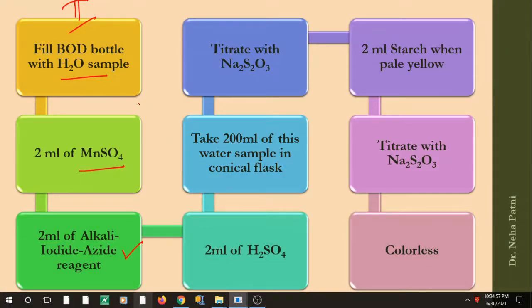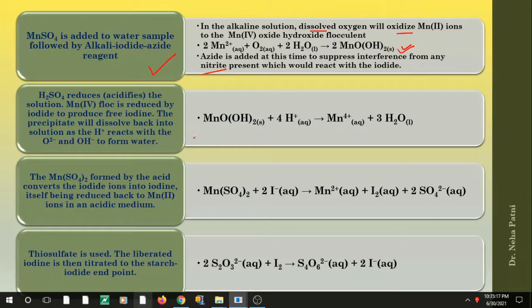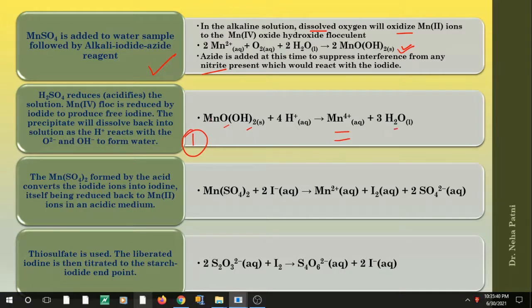After adding MnSO₄ and the alkali iodide azide reagent to the water bottle, you acidify the solution by adding H₂SO₄. Remember the solution was alkaline, so you need to acidify it. The acid plays two roles: first, the Mn⁴⁺ precipitate (floc) is dissolved back into solution as H⁺ reacts with O²⁻ and OH⁻ to form water, dissolving the precipitate.